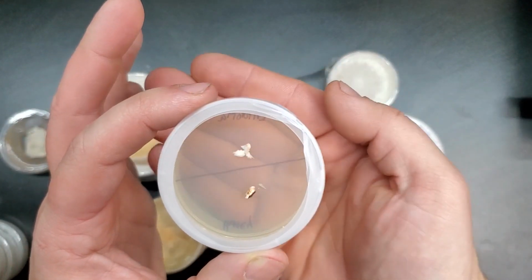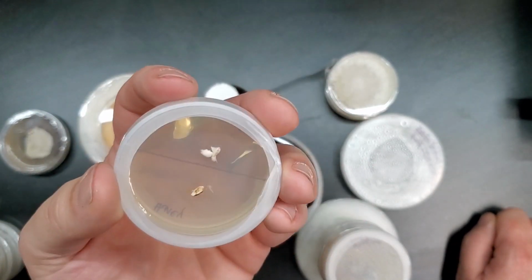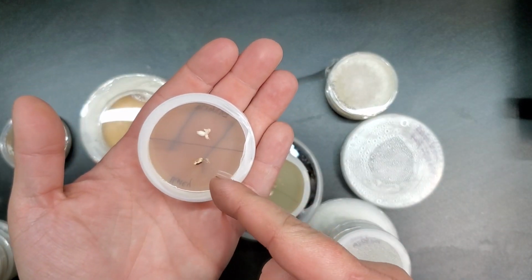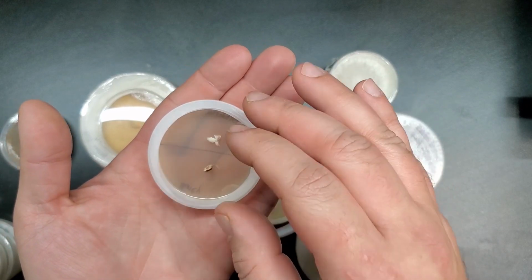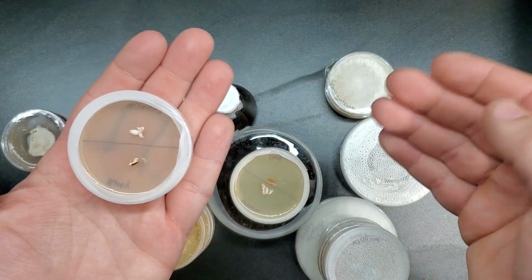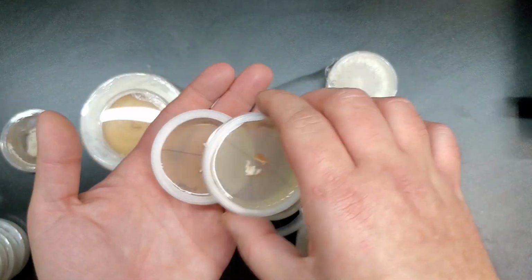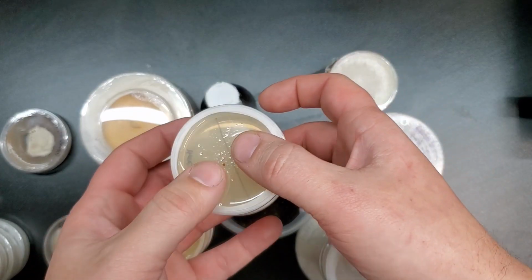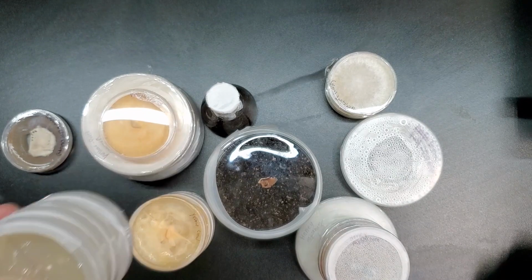And I also used pure light malt extract for these petri dishes just so that it was nice and clear, so it was easier to see the growth and the interaction, hopefully. I want to let these incubate for a while and see what happens whenever the 2 of them grow out and finally meet each other in a controlled environment here in my incubator. I just want to see what they look like whenever they run into each other. So yeah, like I said, these are all the same except for the spacing of the tissue samples. So keep an eye out for this video, because once this does anything, I'll probably make an update to show you what that looks like.